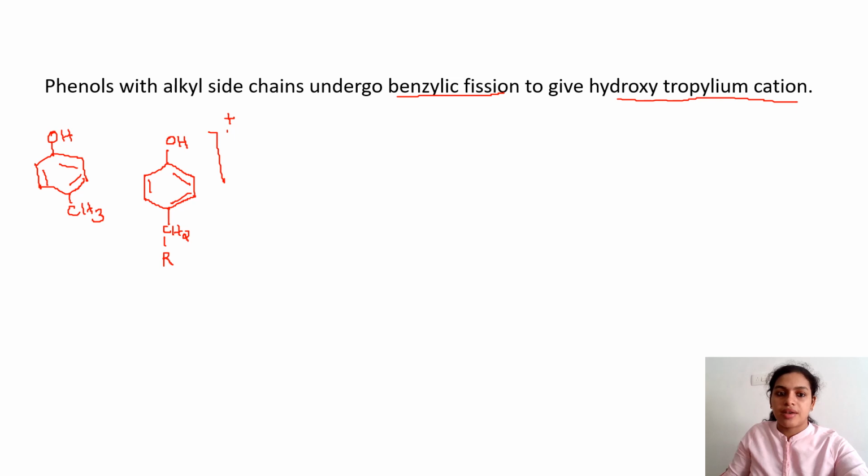From here, dot plus I have given. Okay, this will be the molecular ion, and we cannot say the M by Z value of this molecular ion, because we have taken an arbitrary compound, right? So this R could be different, therefore the mass value can also be different. So in the fragmentation pattern, from a dot plus, two daughter fragments will be there, in which one will get the dot and the other will get the plus. In that sense, I can write it like this: one mode of fragmentation will be R dot and the remaining one as plus.